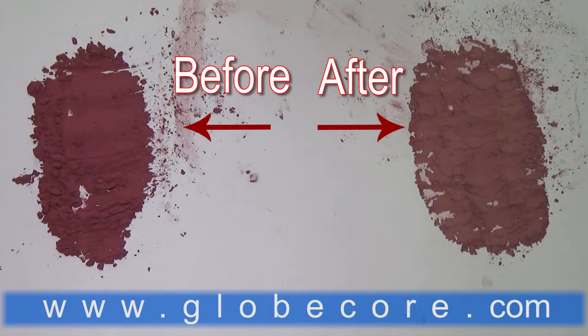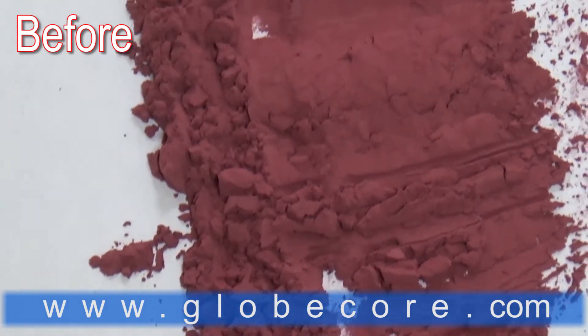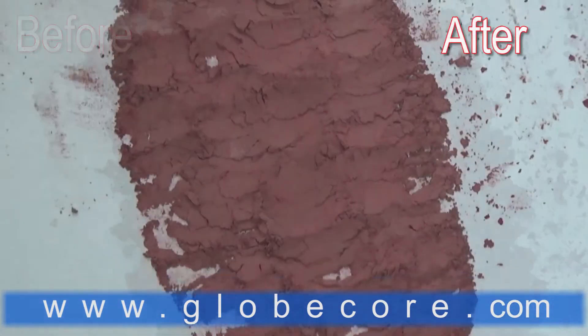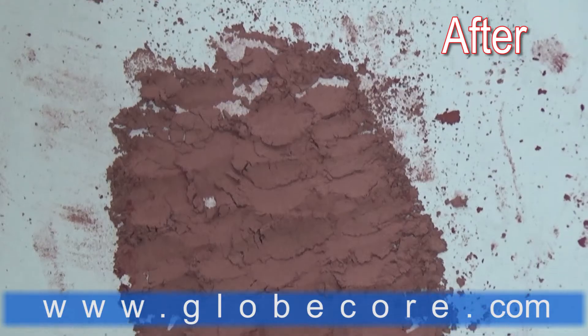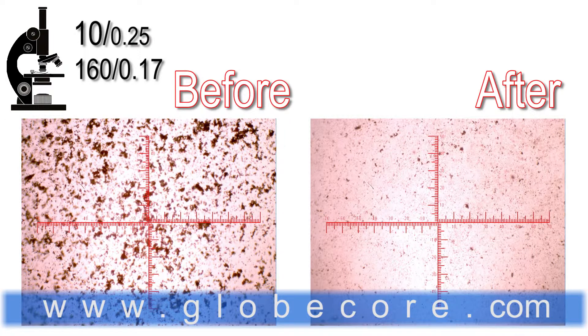The color of the mix changed due to particle pulverization from bright red to pale pink. You can see the results of the process in the photographs taken through an optical microscope.